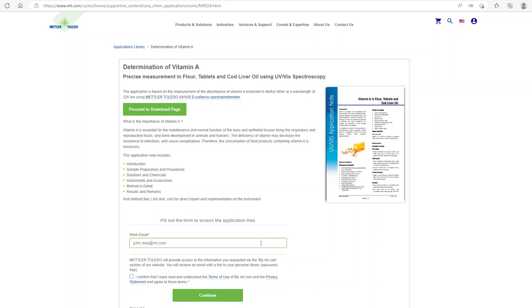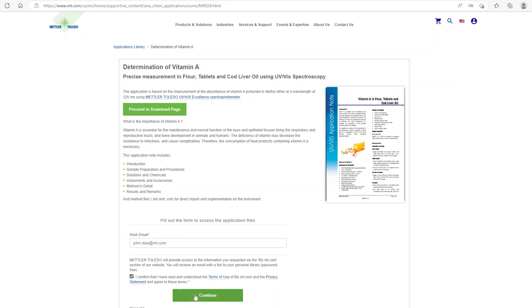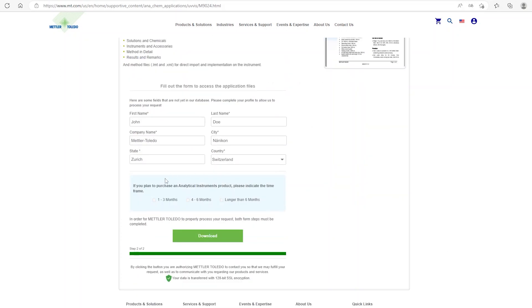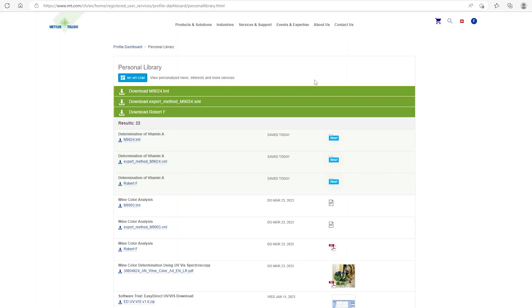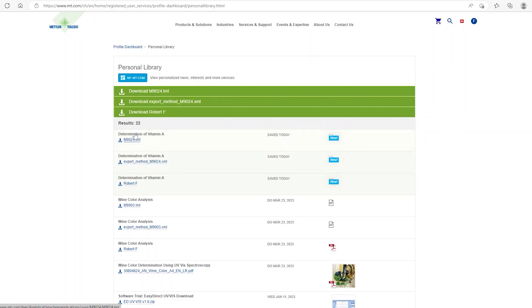To download the application package, you have to enter your email address and confirm the Terms of Use and Privacy statement. By clicking Continue, you are asked to enter some more details and click Download to proceed. After your account on mt.com is activated, you can click on Personal Library. Here you can download the application note as PDF, the Standalone method as XML file, or the LabX method as LMT file.